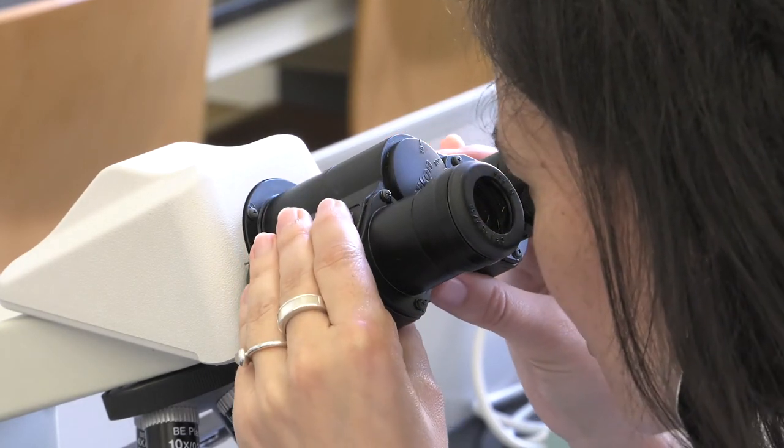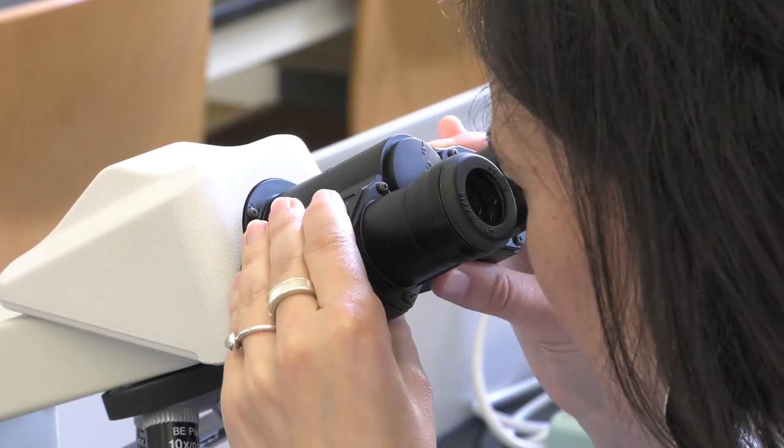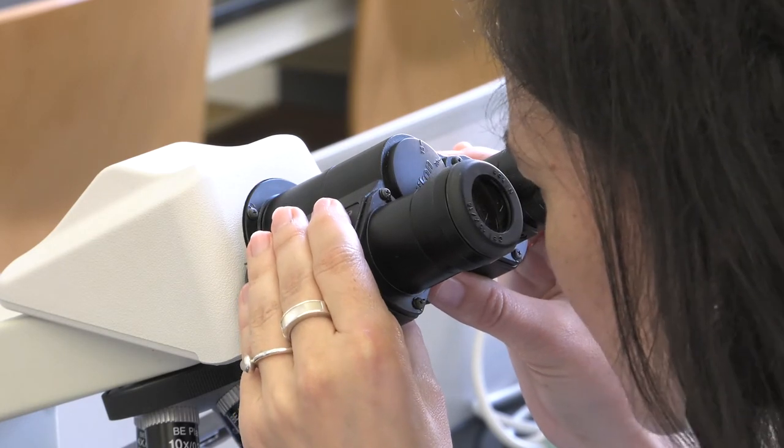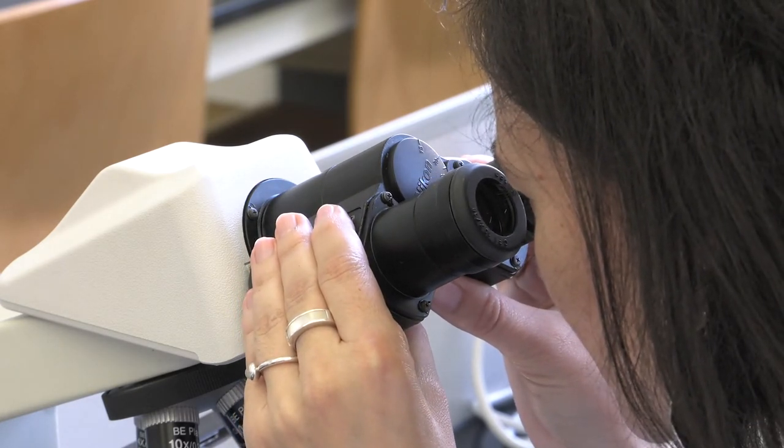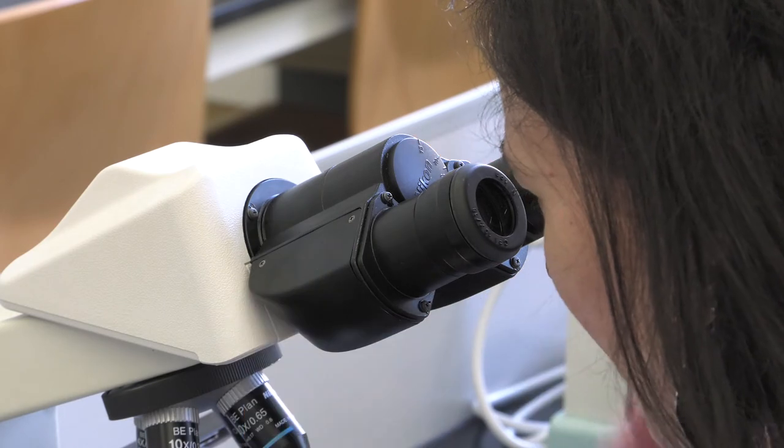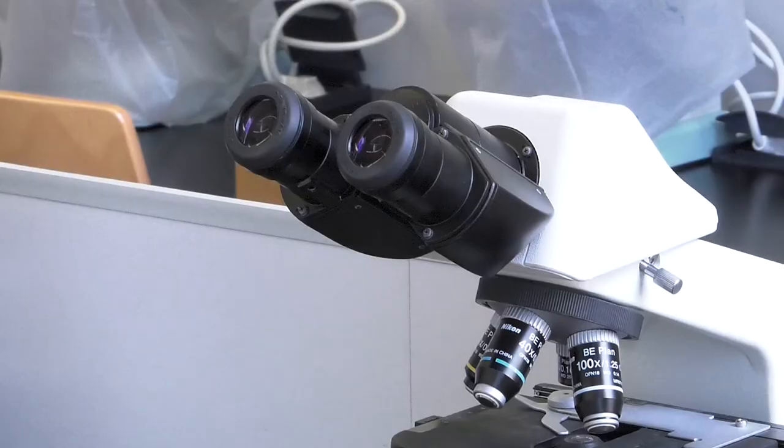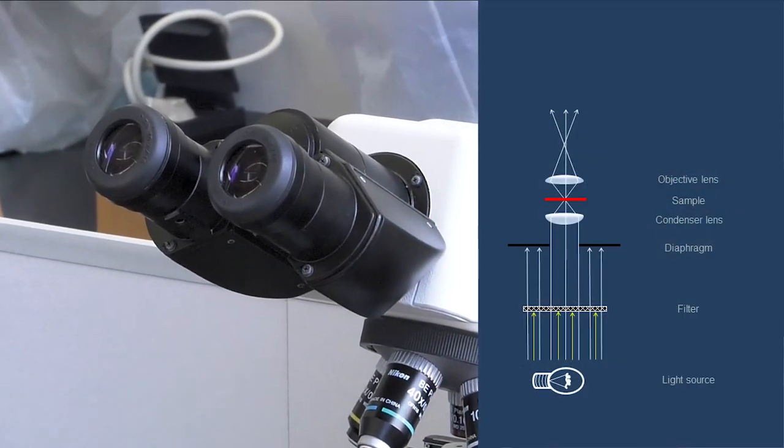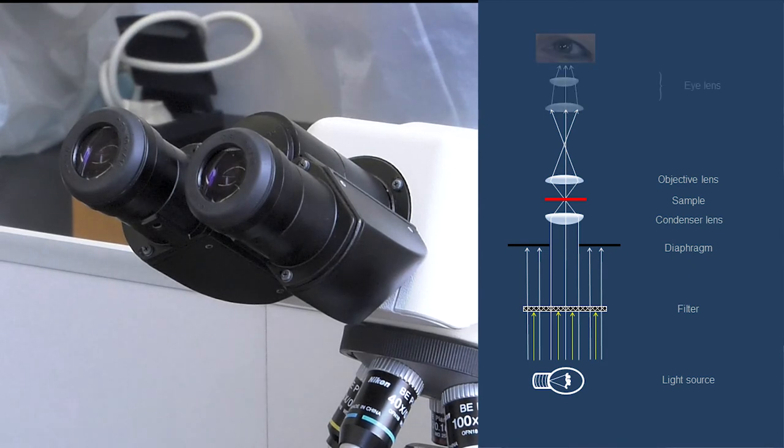The eyepiece tubes can be displaced laterally, so they adapt to the distance between the observer's eyes. The eyepiece lens produces 10x magnification.